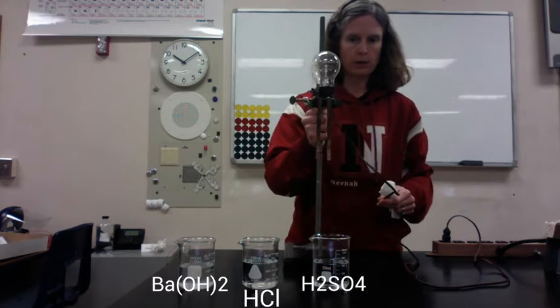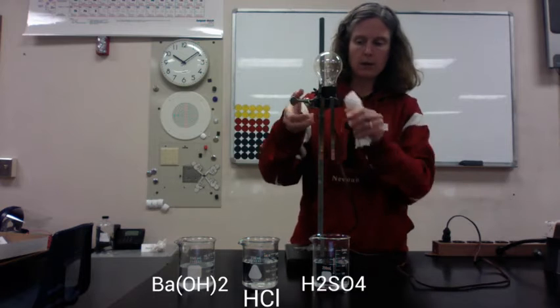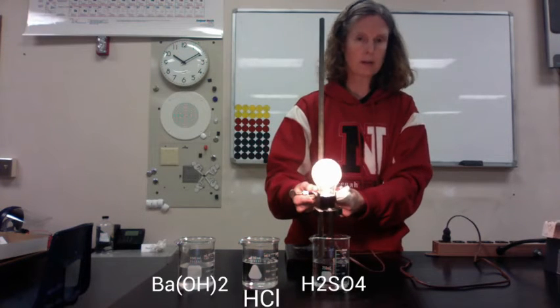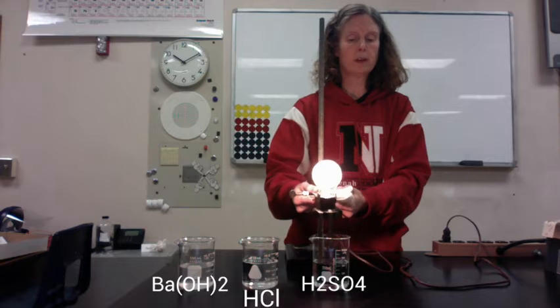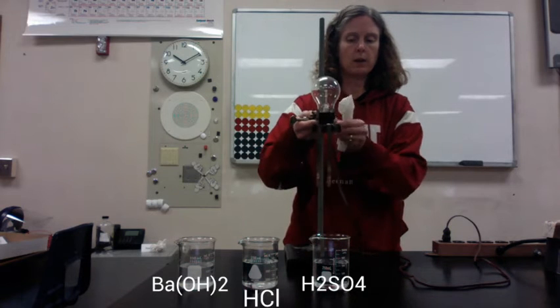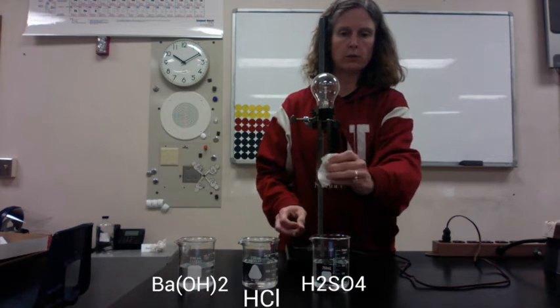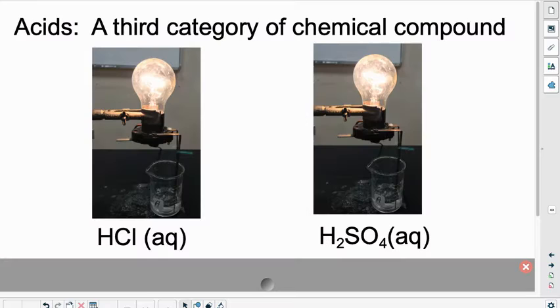And on down the line. To my third solution. And all 3 of these solutions are excellent conductors of electricity.